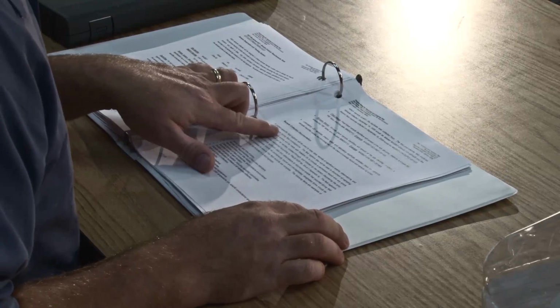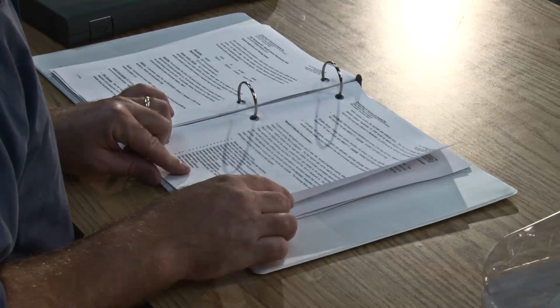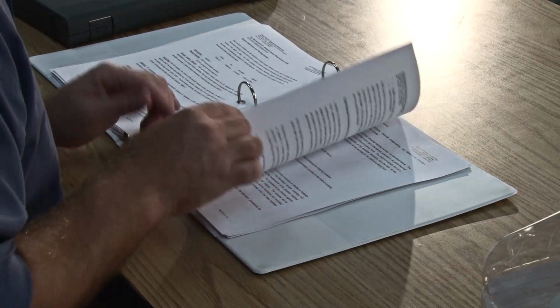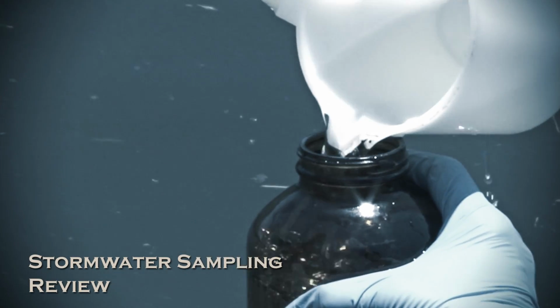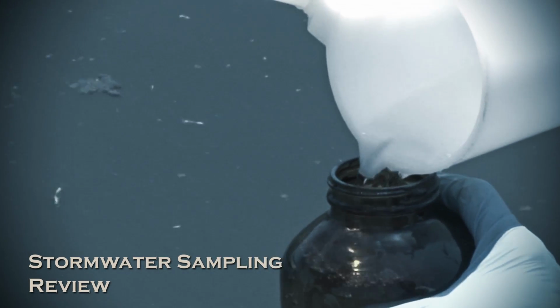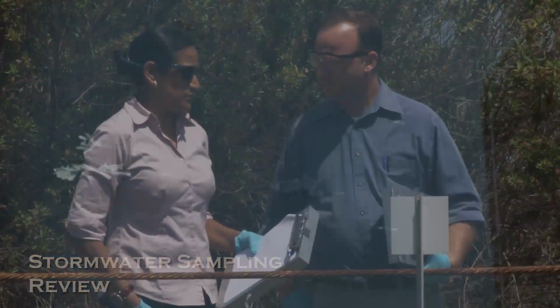There may be a procedural checkoff list in the SAP. Be sure you are familiar with it and use it for each sampling effort. Before concluding this training, let's review the stormwater sampling procedures covered today.